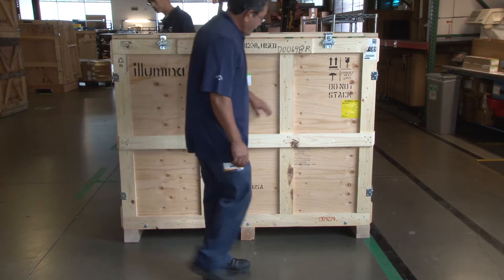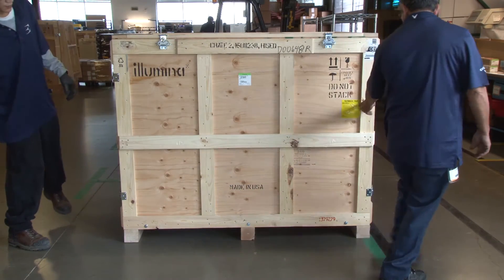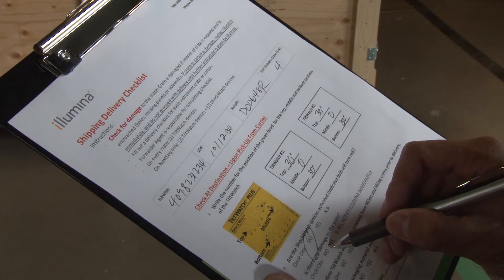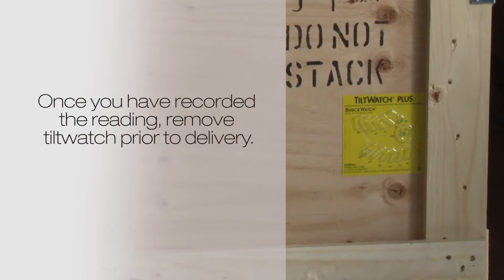Inspect the exterior of the crate for any signs of damage. Report any damage to your dispatcher immediately. Record the tilt watch reading on the shipping delivery checklist. Once you have recorded the reading, remove the tilt watch prior to delivery.